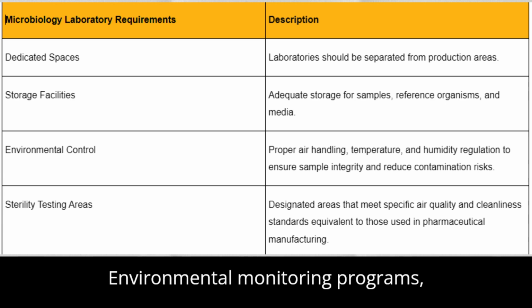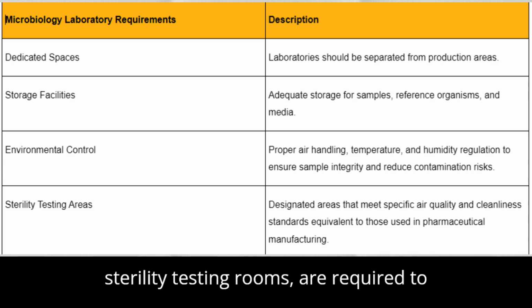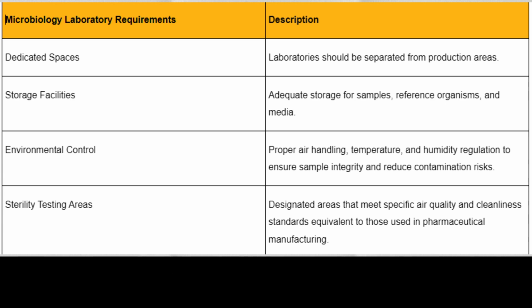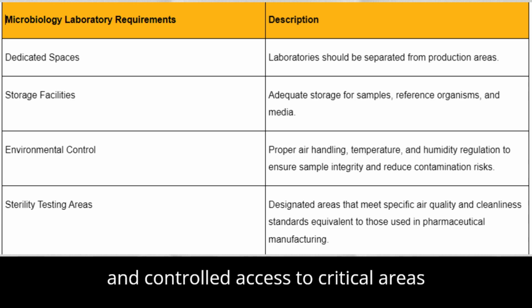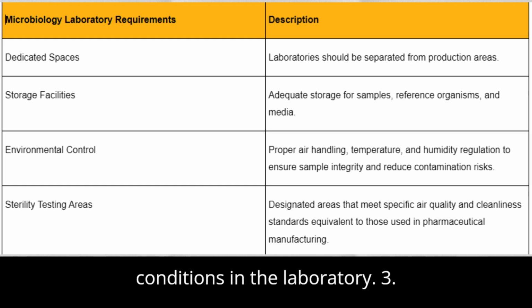Environmental monitoring programs, particularly in high-risk areas such as sterility testing rooms, are required to track potential contamination sources. Regular cleaning, disinfection protocols, and controlled access to critical areas help maintain the necessary hygienic conditions in the laboratory.